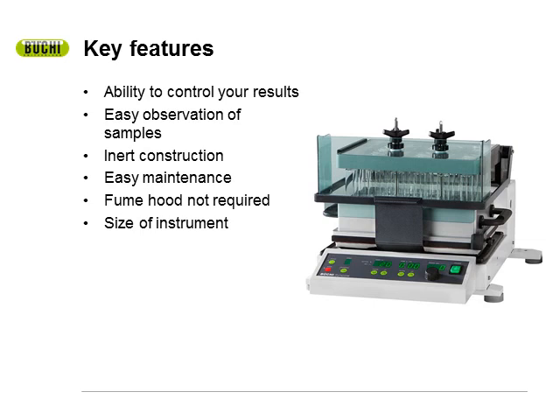You have the ability to control those results because of the 3 variables I mentioned so far: heat, pressure, and coolant temperature, which you can control yourself. For example, if you want higher throughput, you can use a more aggressive pressure on your vacuum pump. If you want higher analyte recovery, you can use a more gentle pressure with a higher coolant flow through the rack itself.